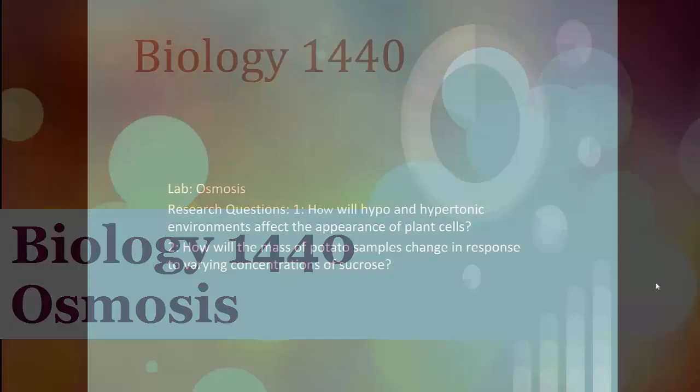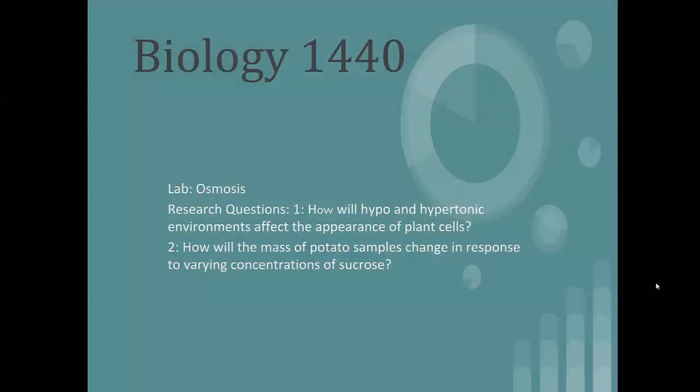This week's Biology 1440 lab will focus on the topic of osmosis. We have two basic research questions. How will hypo and hypertonic environments affect the appearance of plant cells? And how will the mass of potato samples change in response to varying concentrations of sucrose?